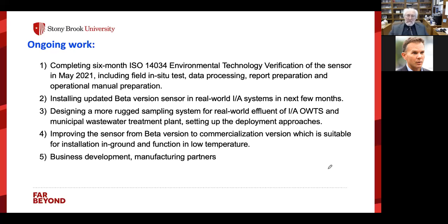We are talking about measuring total nitrogen using a UV system, a flow-through UV light system, to convert organic to inorganic. But maybe it's not a nice conversion. We're thinking about adding different features into the sensor box. But I'm wondering if that is necessary if the organic species concentration is so low in the total effluent. Very good comments. Thank you.